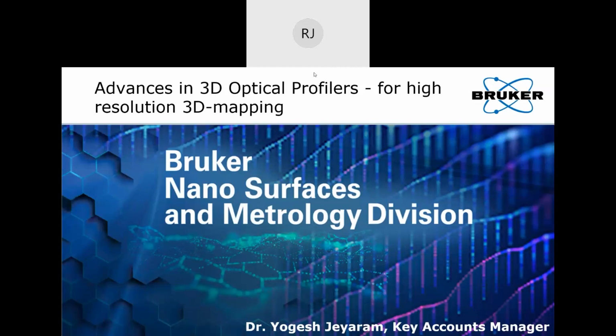Yeah, thanks, Raghav. Good morning, everyone. So today I'm going to talk about the 3D optical profiler and what the advances in this field are, and we will look at certain areas like orthopedics and 3D printing to look more closely into the things, right? So that's the concept for today.